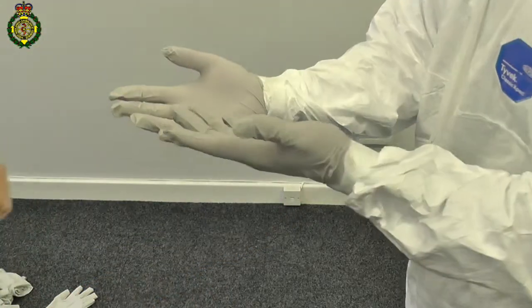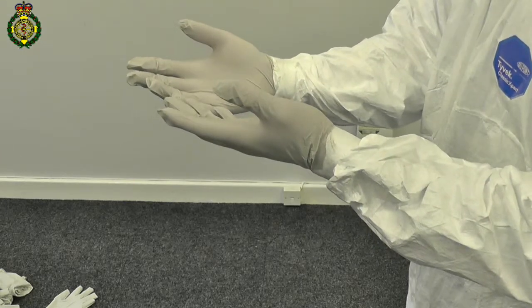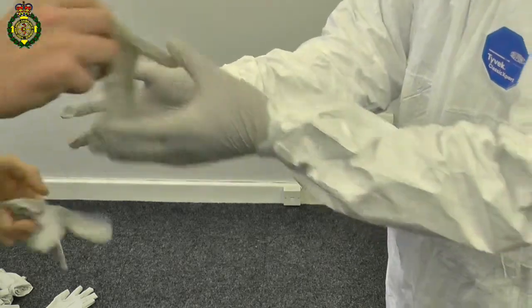Then put on the second pair of gloves, making sure the second pair covers the cuffs.